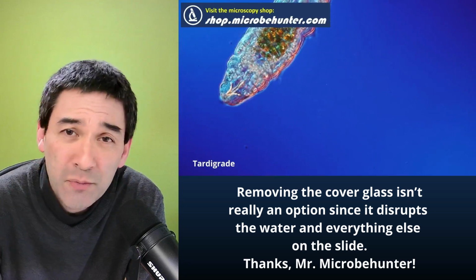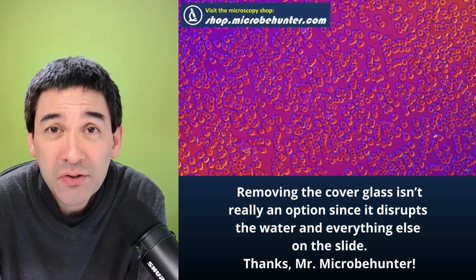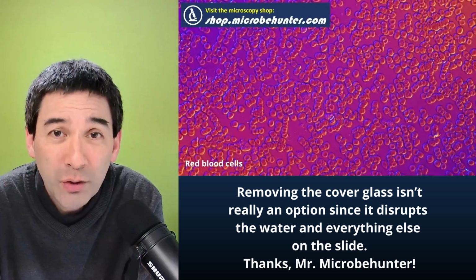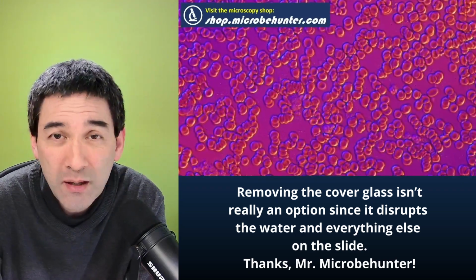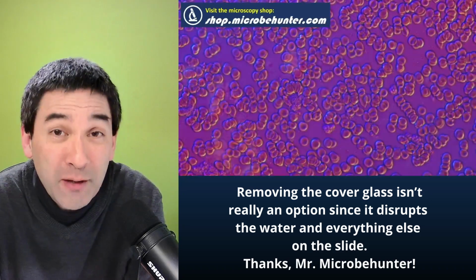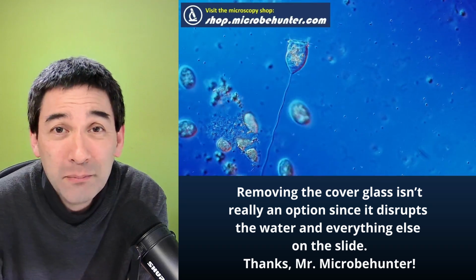pipette. I'm using one that goes to a maximum of 50 microliters and a disposable plastic tip to suck it off. Really, I just dip the tip into the droplet of water on the microscope slide and then simply carefully suck it off. So I basically observe under the microscope until I approach the tardigrade or whatever microorganism I want to pick off, sufficiently close with a microliter pipette tip, and then I simply suck it off a little bit.